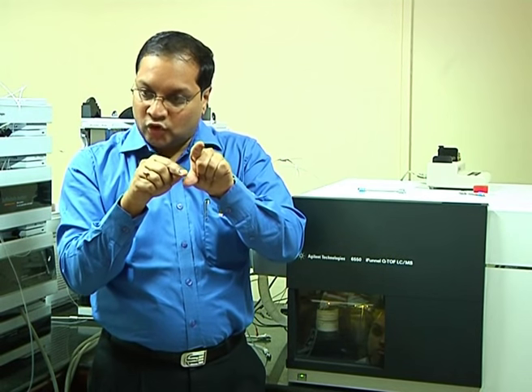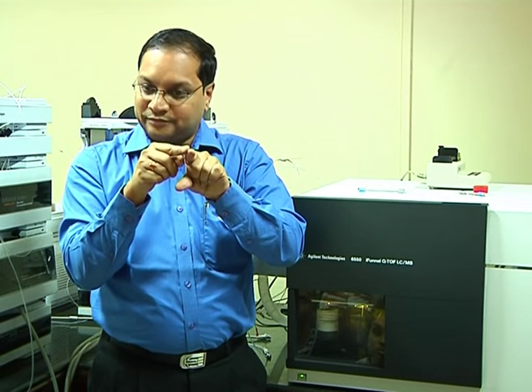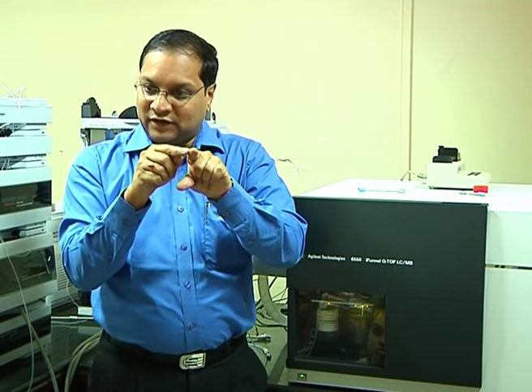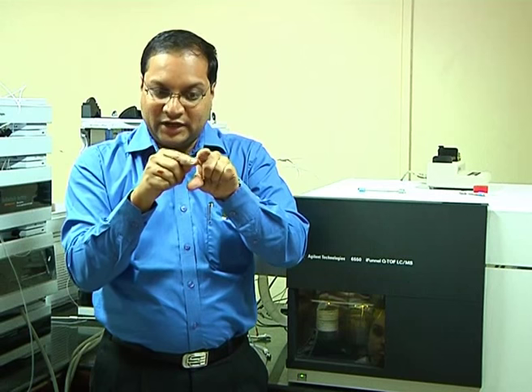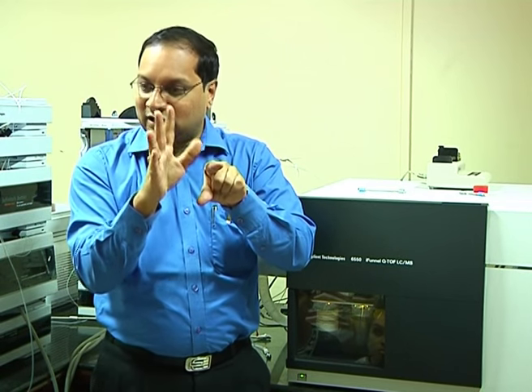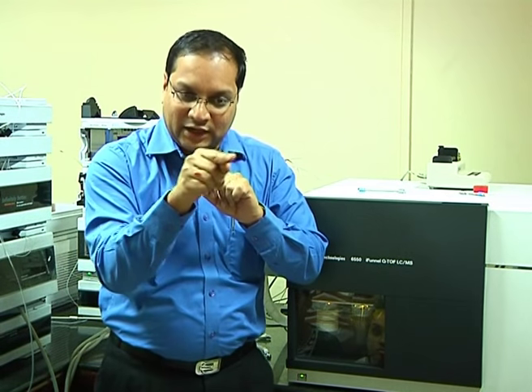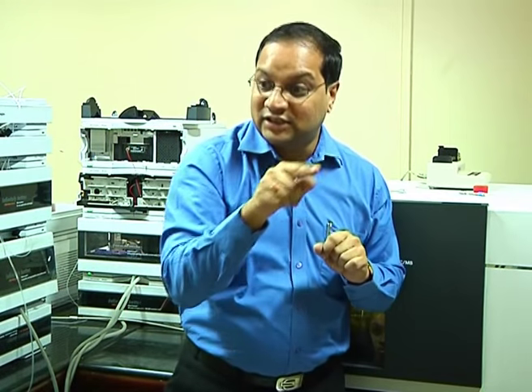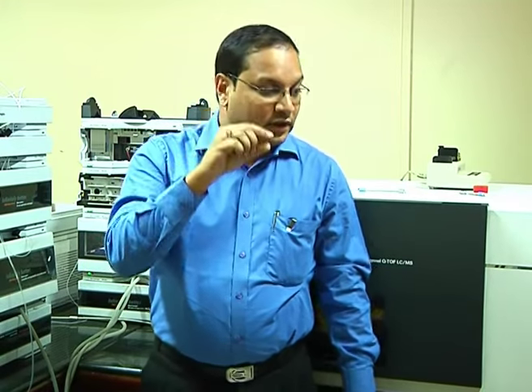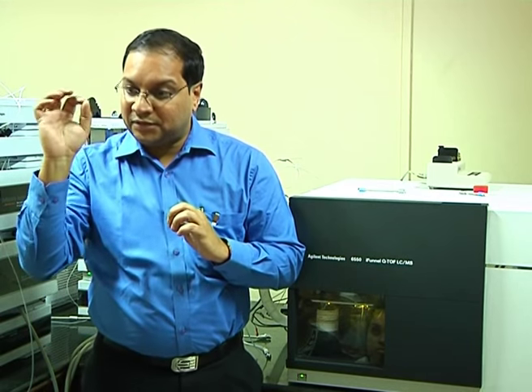So the moment it comes close, the polarity switches. This becomes DC, this becomes RF. So now, instead of attracting, this will repel the 500, and this will attract. So it will travel like this. During this, probably the other 5,000 will hit here and get lost. Then again polarity switches. Then it comes here. Like that, it will travel through the quadrupole selectively, and the other 10,000 will hit somewhere or the other and get lost. So in this way, we can filter mass with very high specificity.